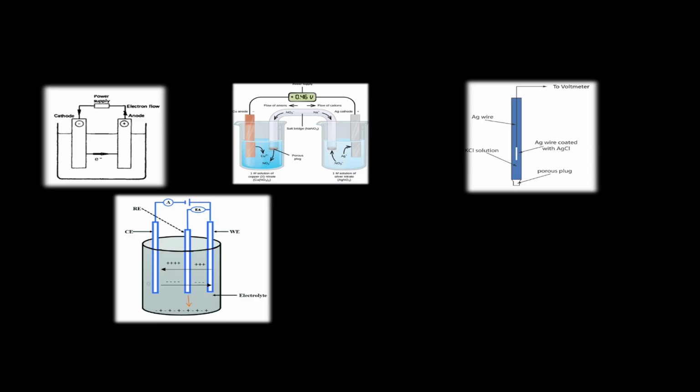If the electrodes were of two different elements, such as one being copper and the other being silver, using an inert electrolyte such as potassium chloride, potassium nitrate, or sodium nitrate with equal ion transport numbers minimizes the potential buildup at the liquid junction, optimizing the cell's efficiency. Where the bridge contacts the solutions at each end of the bridge, a small voltage potential will develop. This is the principle to which a reference electrode works.